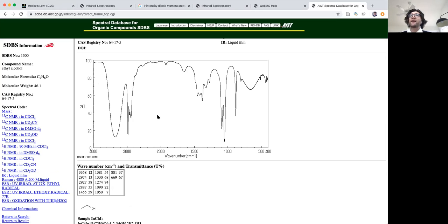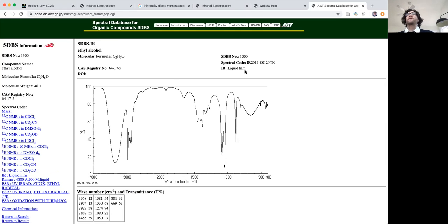And there's nothing in that characteristic double bond region because there are no double bonds in the molecule. So using the many resources that you see here, hopefully you will have a better appreciation for how to use an IR spectrum to find what types of bonds are there. And this has been section 14.6.